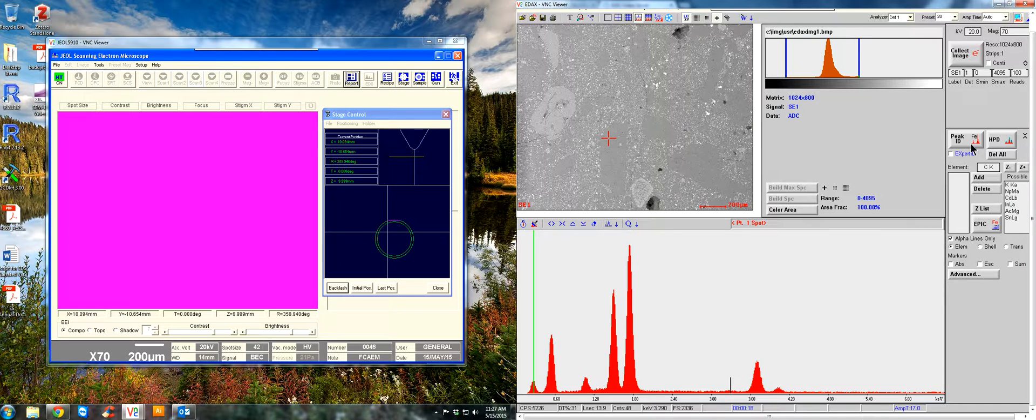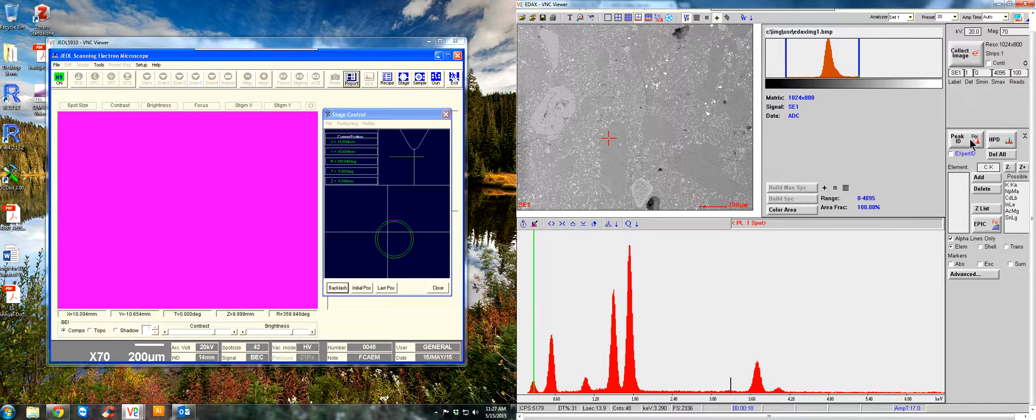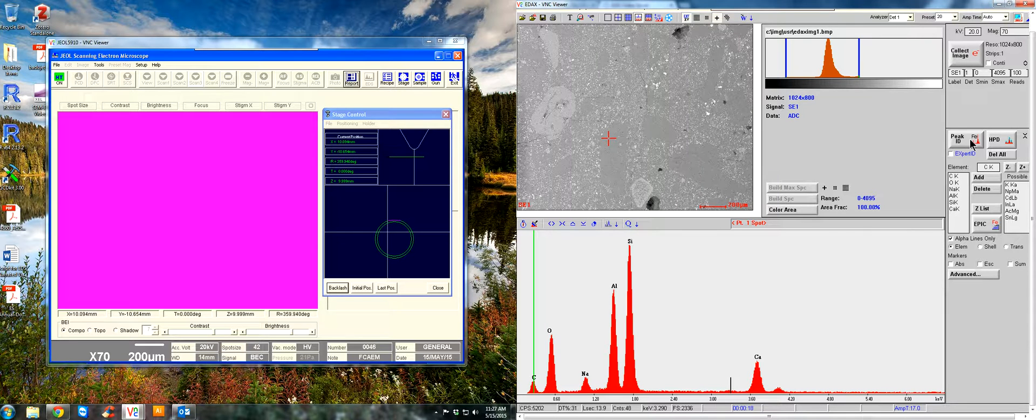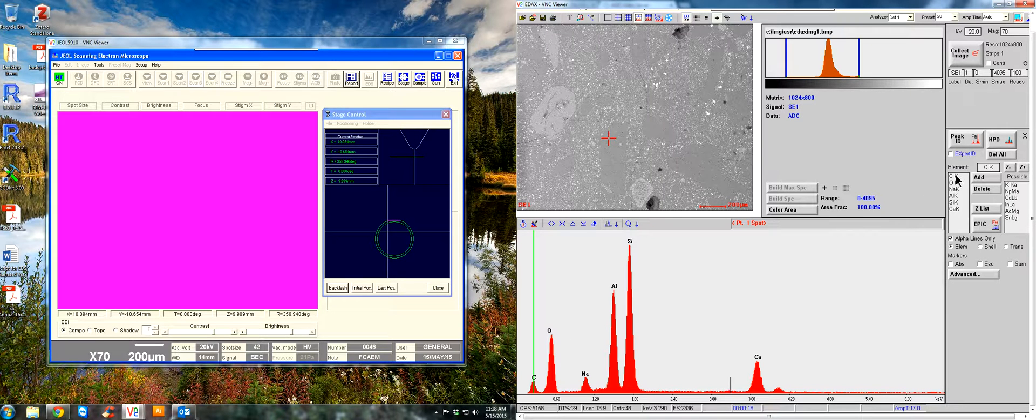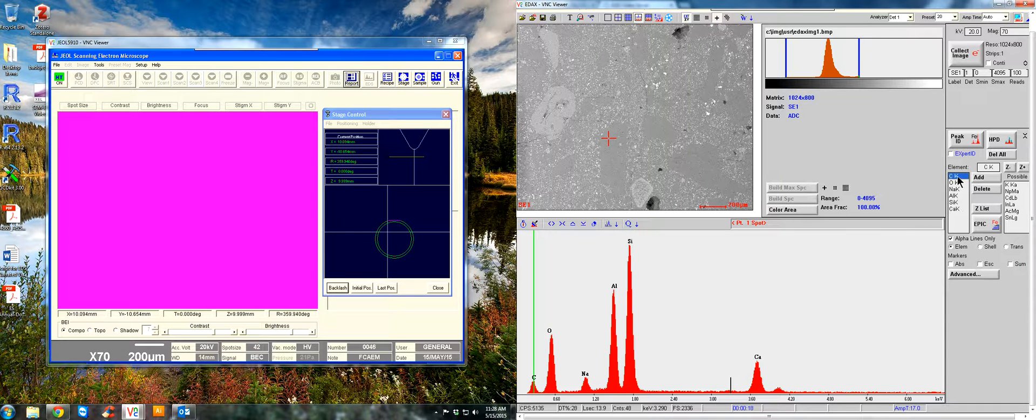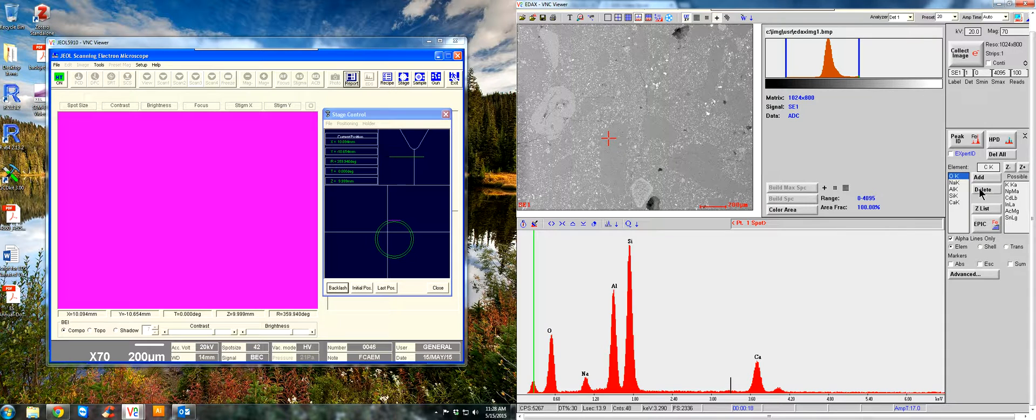You can hit the automatic peak identification button right here so that the Genesis software can identify your peaks for you. I'd like to caution, though, that sometimes it does get it wrong, especially if there's peak overlap. So a lot of times I like to manually identify the peaks. So let's go ahead and do that. This right here is your element C list. These are the elements it picked or automatically ID'd for you. So let's go ahead and delete them.